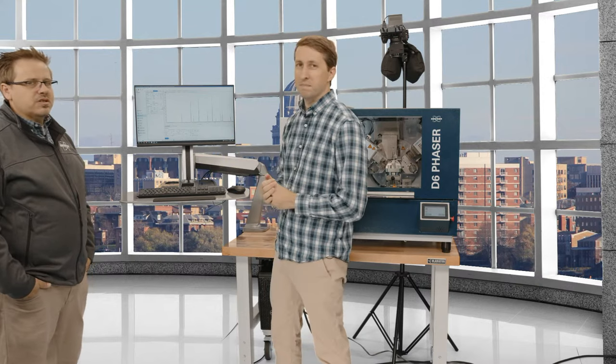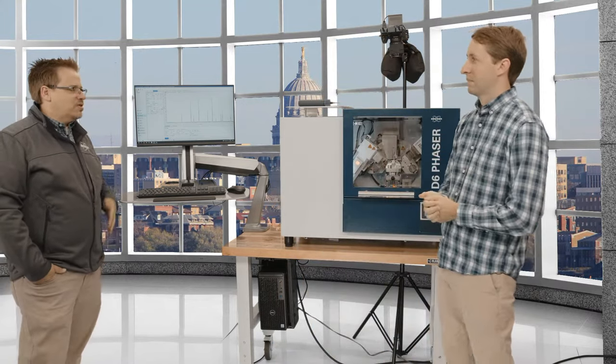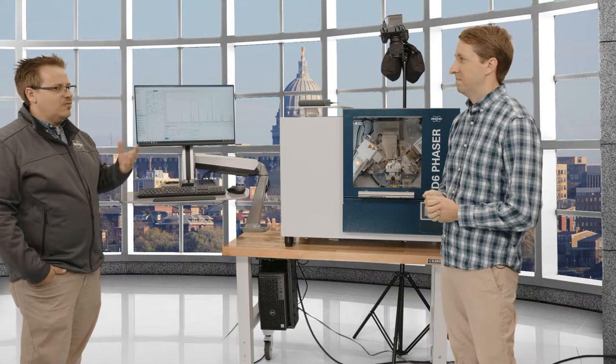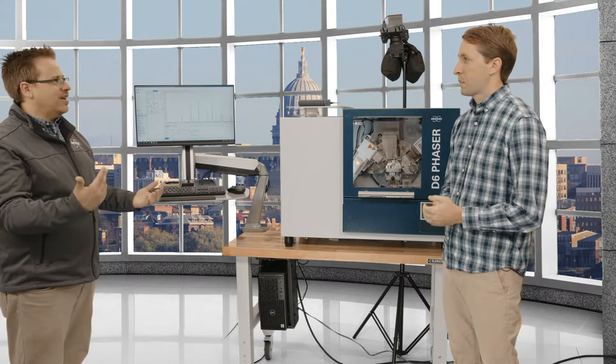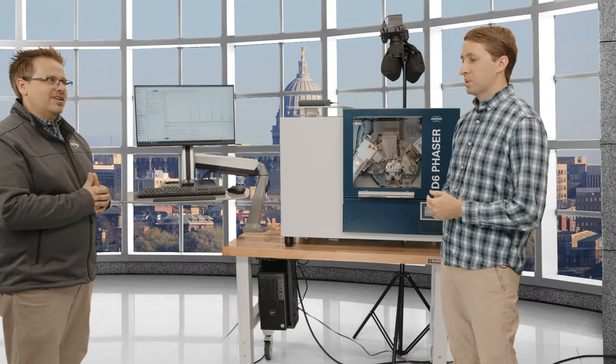Yeah, I remember visiting some people once out there, and man, we were struggling because they really wanted the 1D detector for the advantage of the speed. Yep. But at the time, we didn't have all these optimization steps, and you would either set that air scatter screen higher. Okay, now you can get all the good high angle peaks, but your low angle, not so good. It's really difficult to optimize for both.